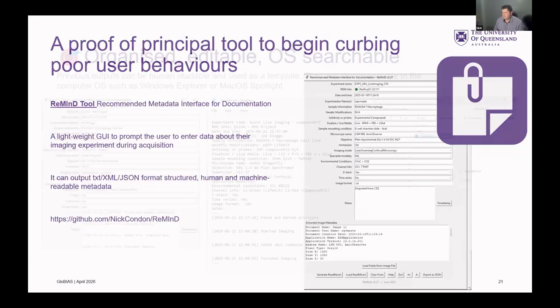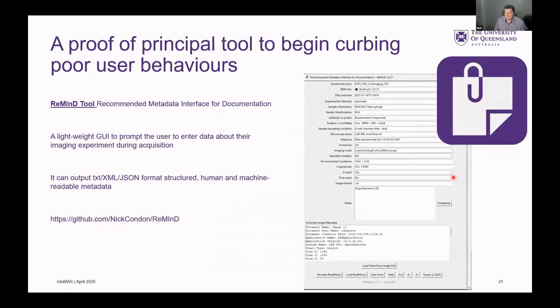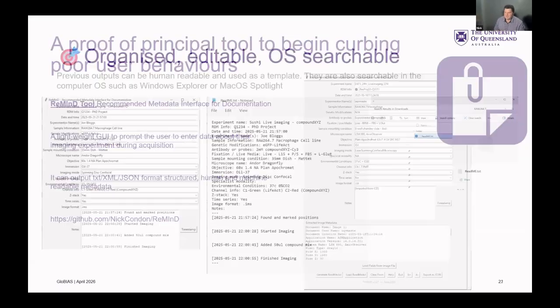Actually, what it also does is, researchers are lazy, so we could capture some of the instrument metadata as well by just loading a file, and I leveraged some of the libraries for CZI readers, LIF readers, things like that. And they're not perfect because there's so many variations across the different systems, and we're still running some 710 Zeiss systems, for example, that are getting a bit old. But it mostly works.